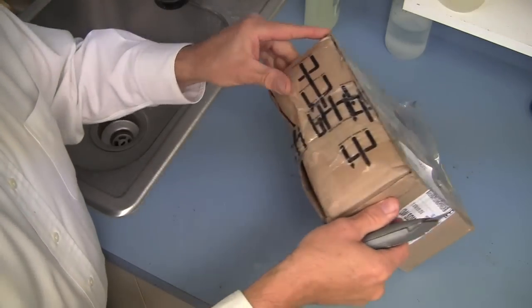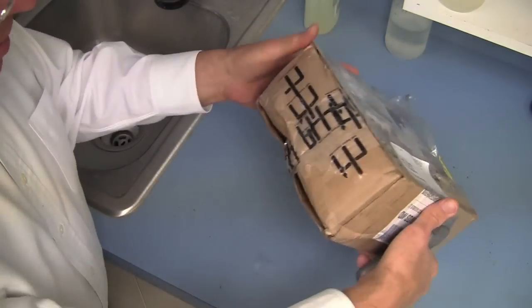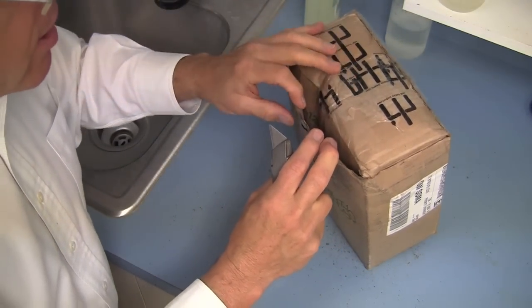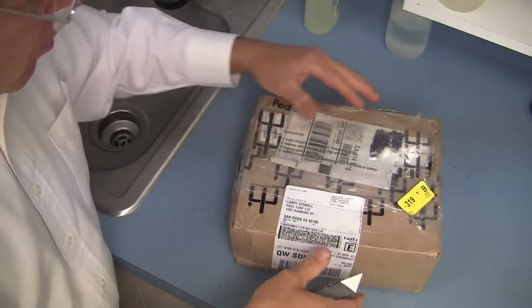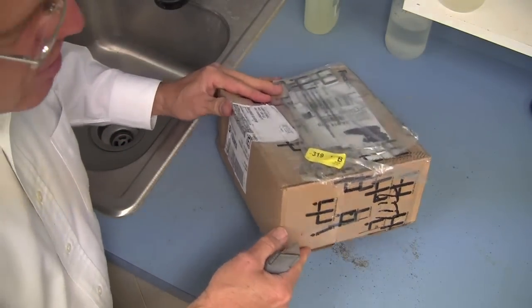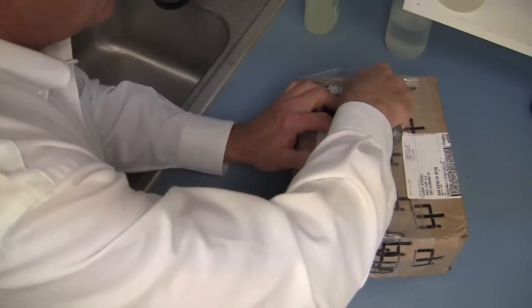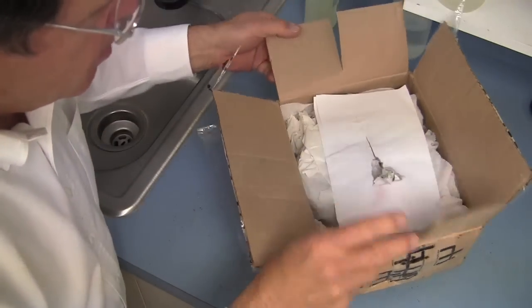Okay, so here we go. First thing we noticed is that the box had some openings on the bottom so that sand can flow out of the box — that's really not a good way to pack anything. They'll normally get stopped in the shipping process and you'll do a lot of damage to shipping equipment. We want to make sure they're taped off on all sides so that there is no sand leakage. That also tells us the sample was not packed perfectly to prevent it from shifting around.